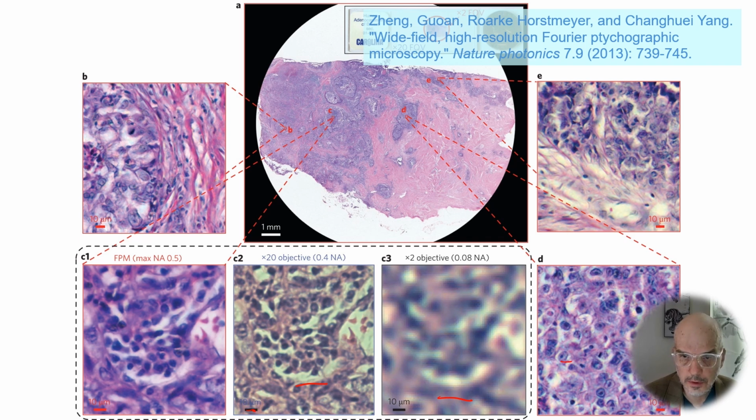The colored reconstructions in B, C, E, and D are all reconstructions with Fourier ptychographic illumination. What's being done here is structured illumination. The object is illuminated from a variety of different directions with different plane wave illumination structures. And then those diverse images are captured through a single 2x, low resolution objective at the lower center, but then combined to create a high resolution image.